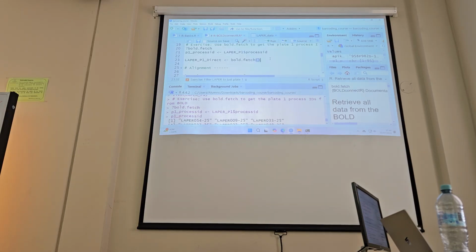We're not going to have time to do alignment, so I might just correct it first. I'll have to do it at home, maybe a little exercise to figure out. But here it's to complete, no? The most abundant bit. How many times did you find it? So we'll continue to one. Put it in place.